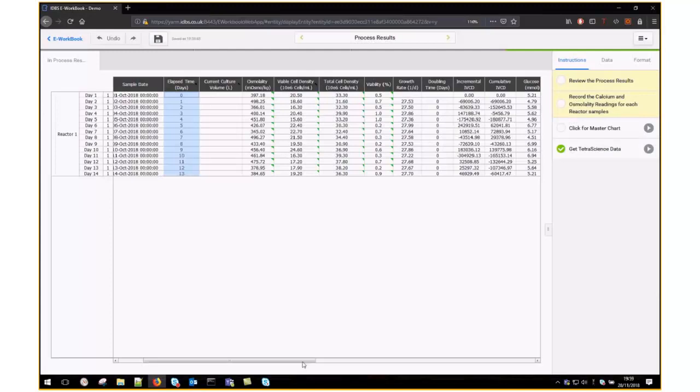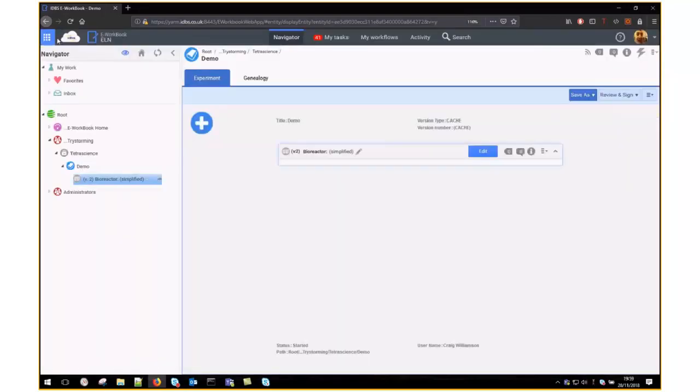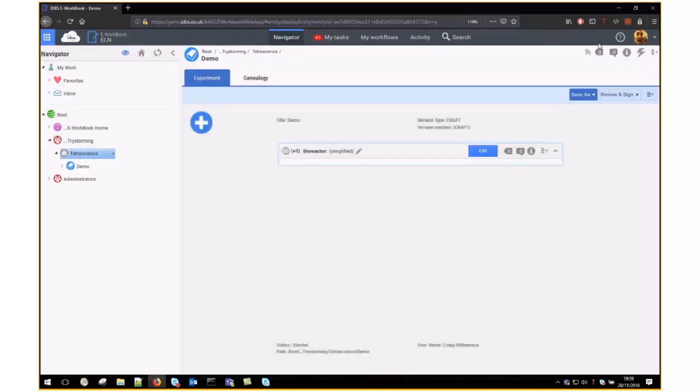With the current version of eWorkbook, version 10.3.3, this is as far as it is possible for us to streamline the process. In future versions, it is intended to add a capability to manipulate spreadsheet data without first establishing a user session. This will allow us to automatically log into a spreadsheet and push the Start button we have just seen programmatically. This eliminates entirely the need for the scientist to spend any of their time finding and importing data into their spreadsheets.